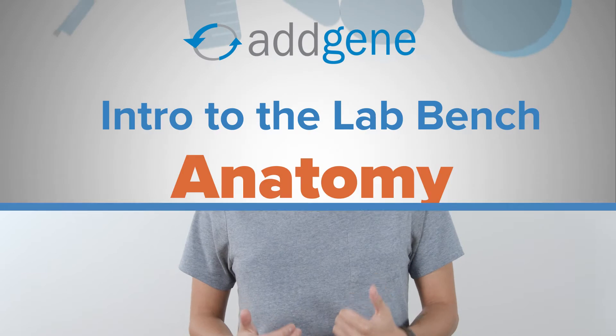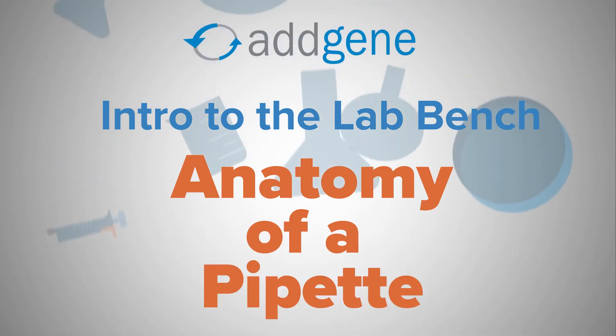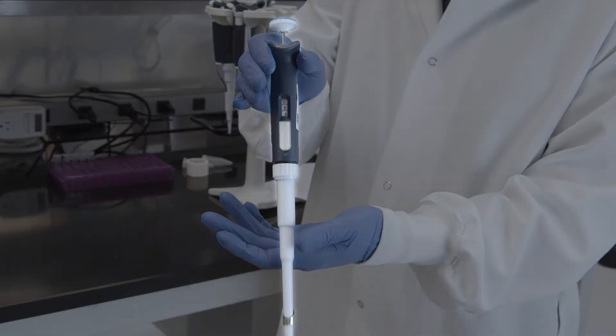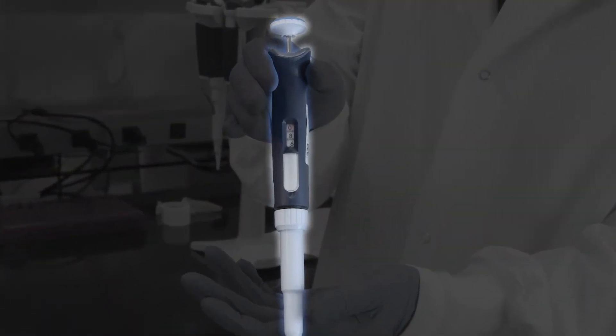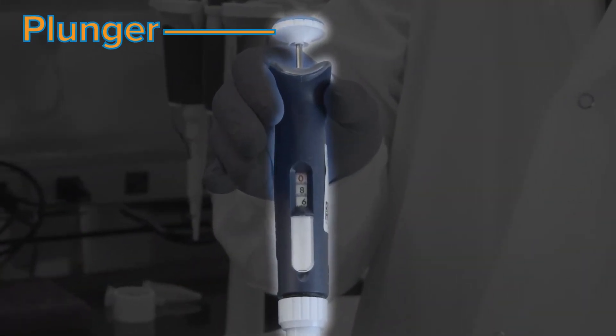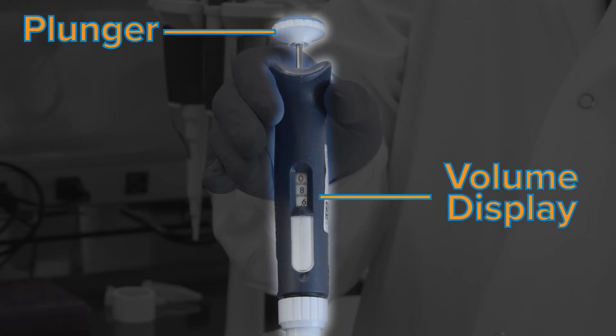Have your pipette? Great! That means it's time to talk about the anatomy of a pipette. Here's a P1000 pipette. From the front, you can see the plunger at the top. The plunger is used to both draw liquid into and expel it from the pipette tip. Next, in the middle, you can see the volume display. This shows the set volume amount that will be drawn up into the tip. We'll show you how to read this display a little later.